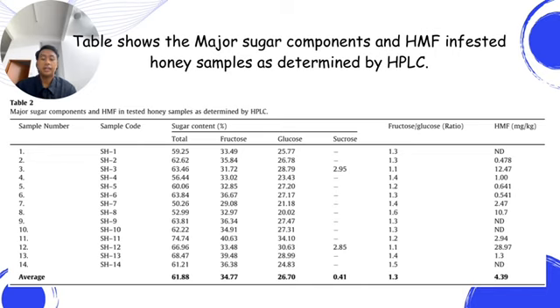One of the major characteristics of honey is that fructose is present in higher amount than glucose. Approximately 40% is fructose and 30% glucose in honey, but this can change depending upon the storage time and temperature, among other factors. The sucrose is also present in low amount, ideally not more than 5%, except honey from fruit-specific plants.